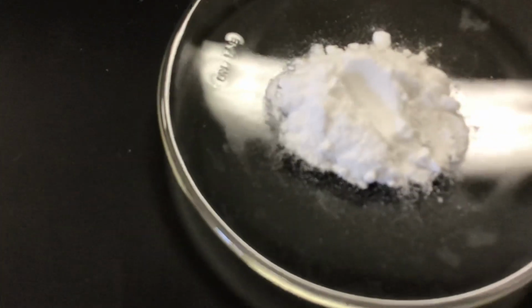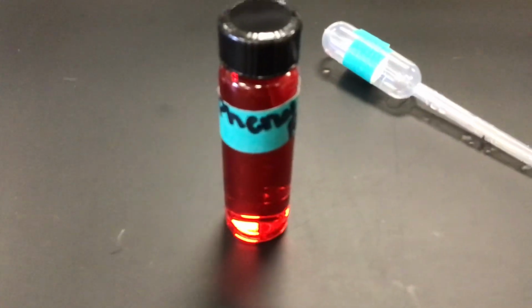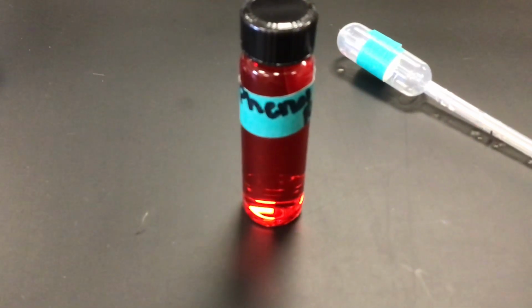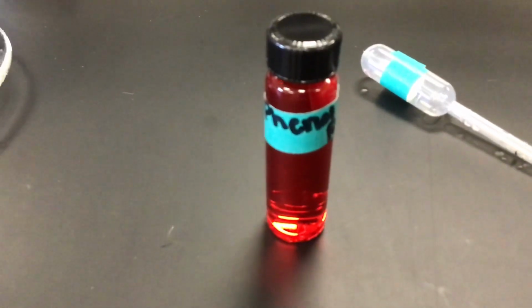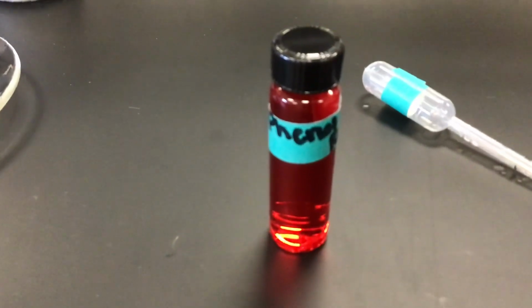All right, and the last one, phenol red. We have phenol red in a vial here. Make sure we can get that into frame. So here's phenol red. If you can't tell, it is a liquid. So what color is it? Describe that for me. All right, when you are finished describing those things, we are going to move on to part 2.